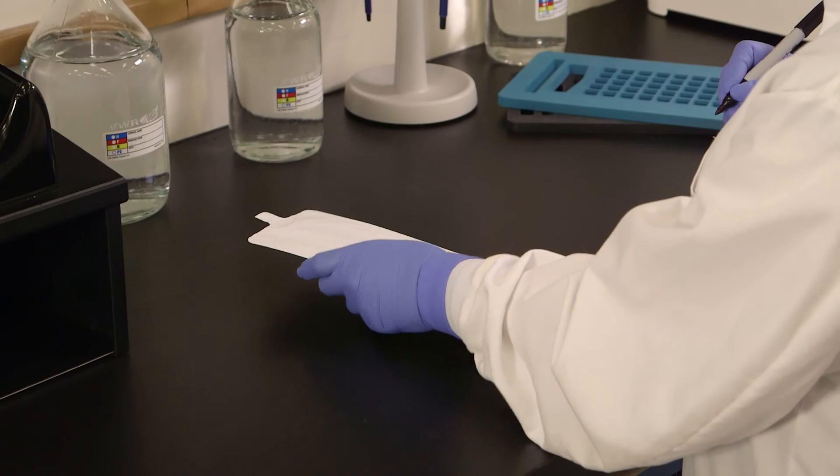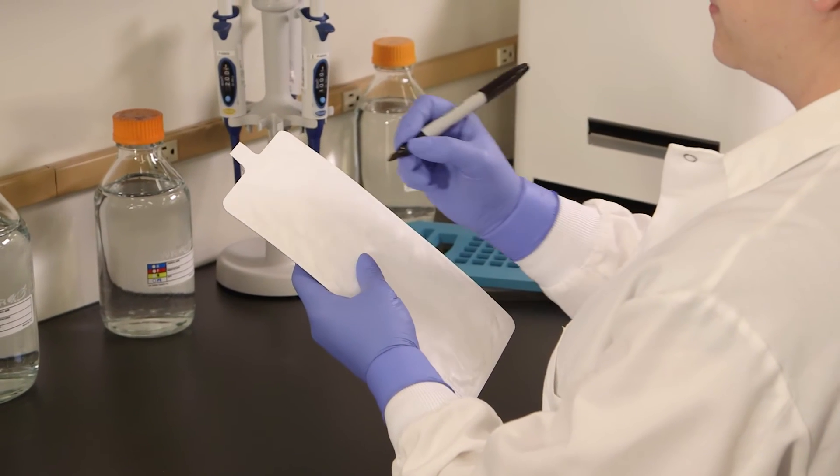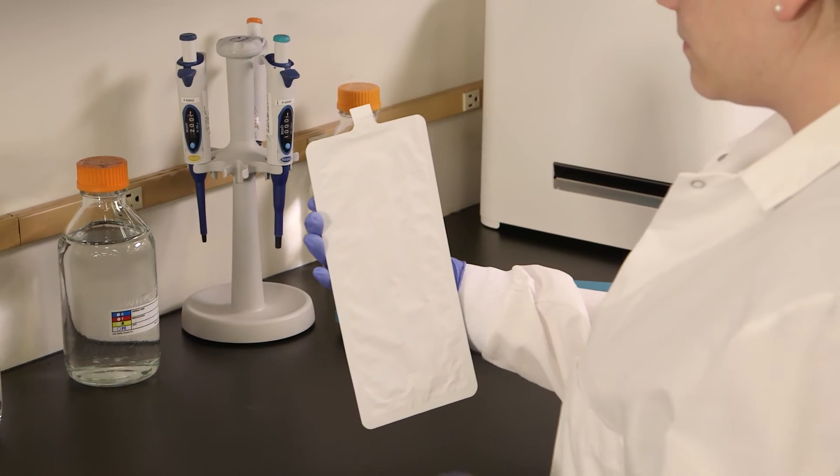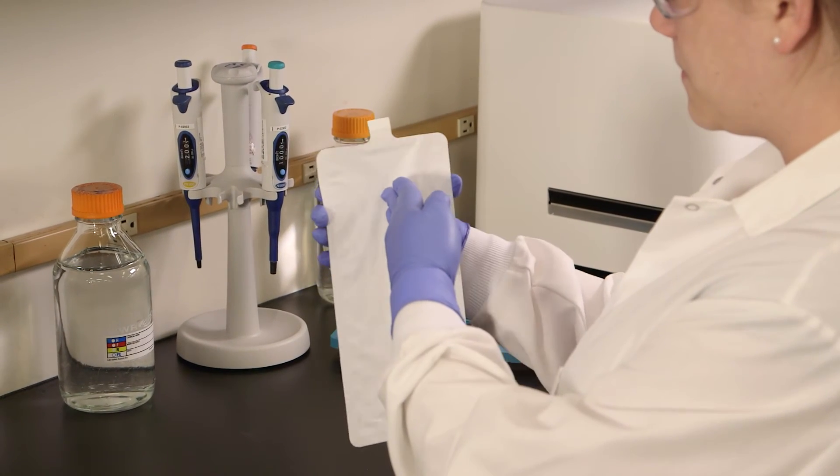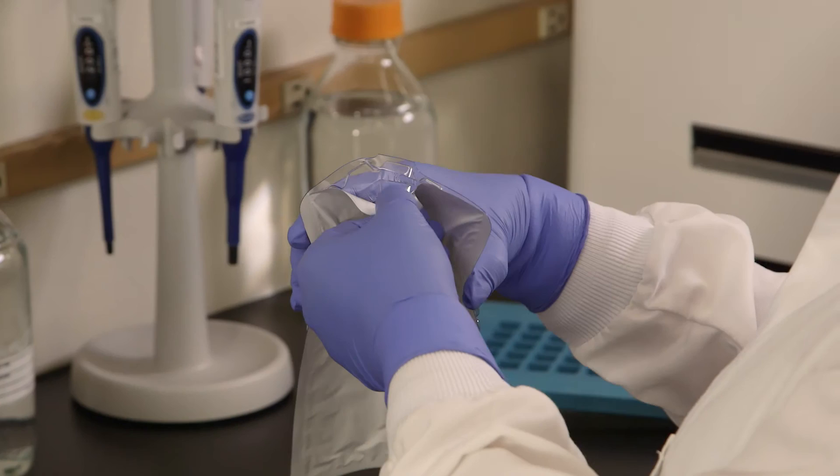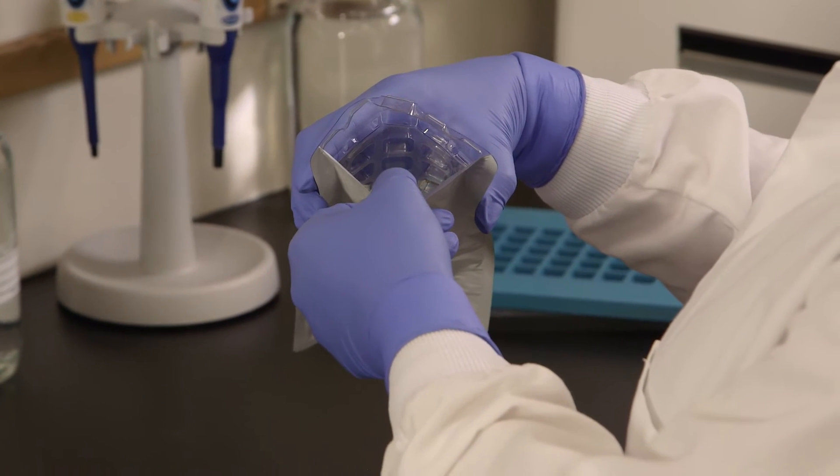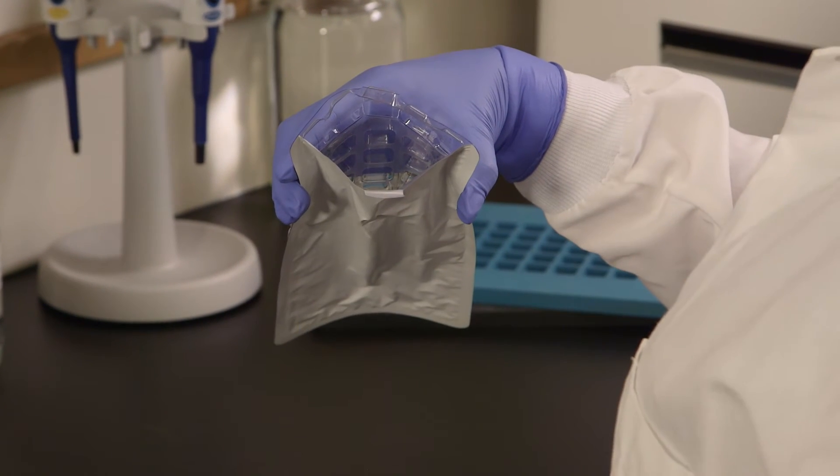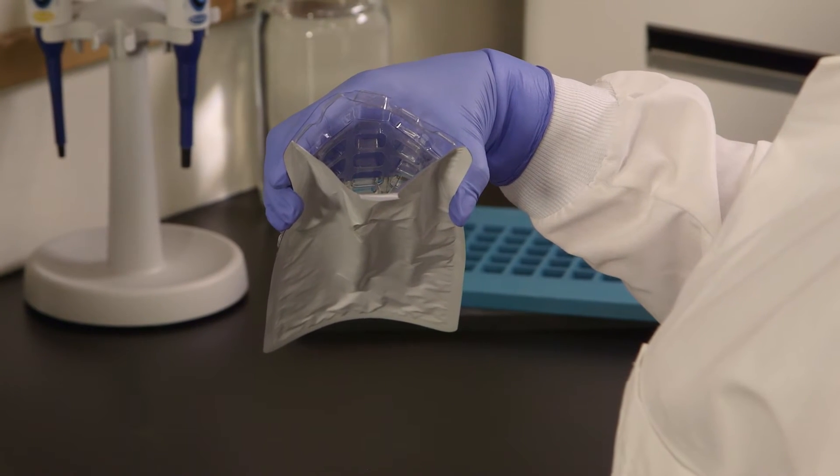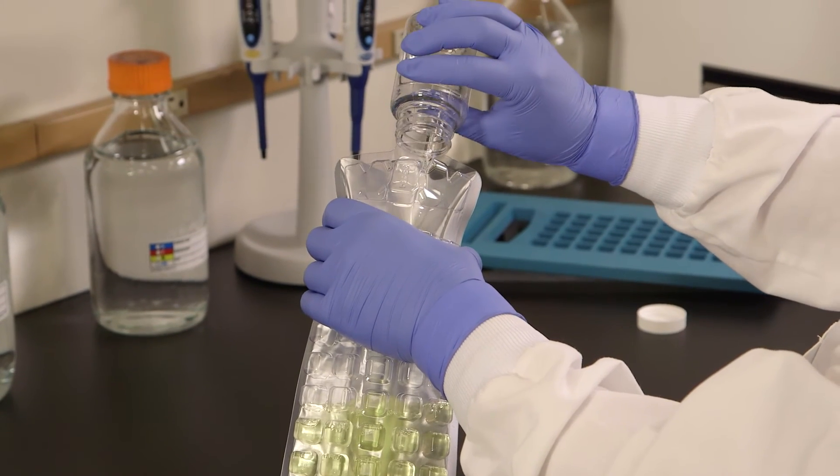Use only a permanent felt tip marker to label the Quantitray. Adhesive labels may adhere to the sealer roller and ballpoint pens may puncture the paper. Hold the Quantitray at the top with the well side facing your palm. Push the top edge of the Quantitray in with your free hand while squeezing the tray into a circle. Open the Quantitray by gently pulling the foil tab away from the plastic side. Be careful not to tear the tab. Do not touch the inside of the tray. Pour the sample mixture into the Quantitray, avoiding contact with the foil tab.